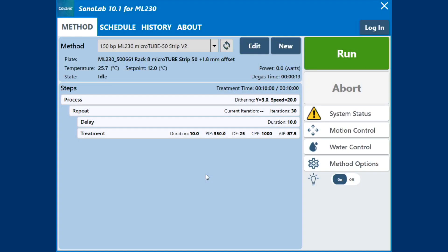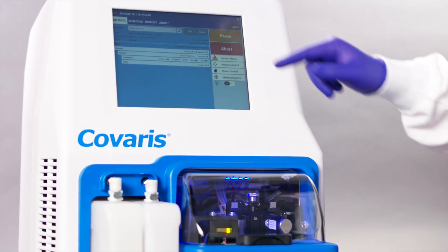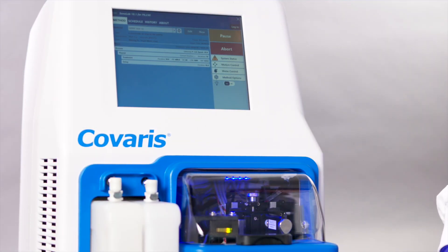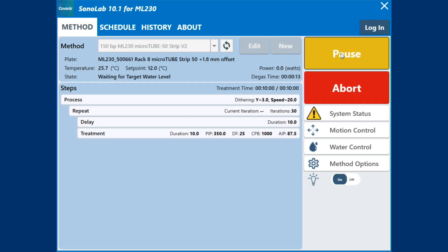When the Run button is green, the selected method may be started. Touch the Run button to start. The green Run button becomes a yellow Pause button and the Abort button turns red.